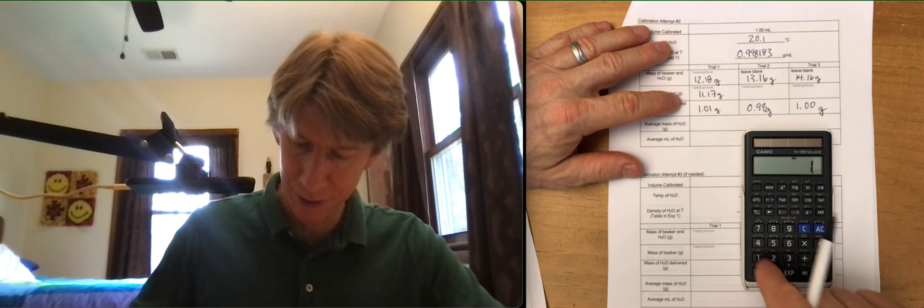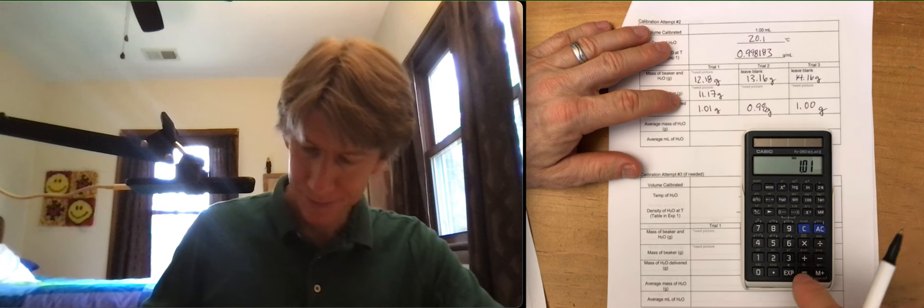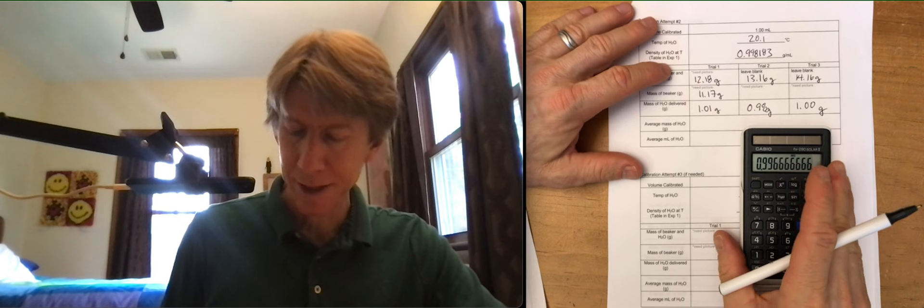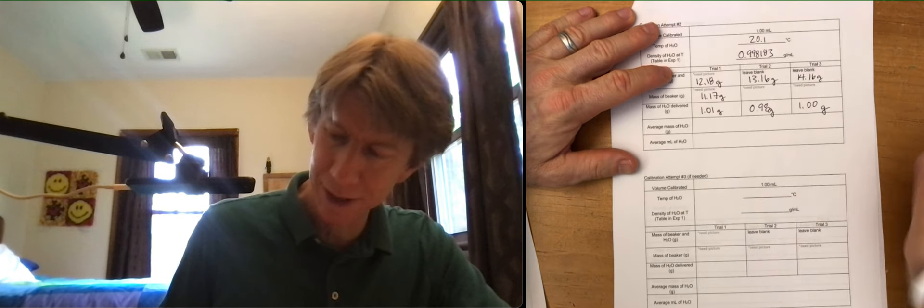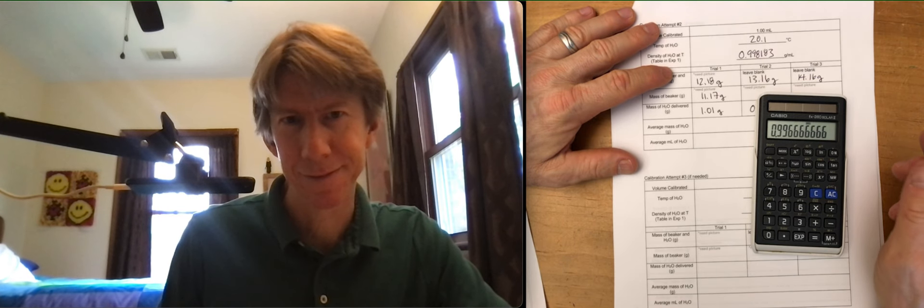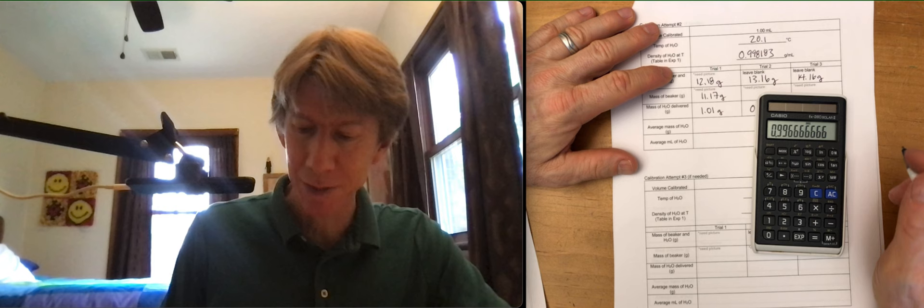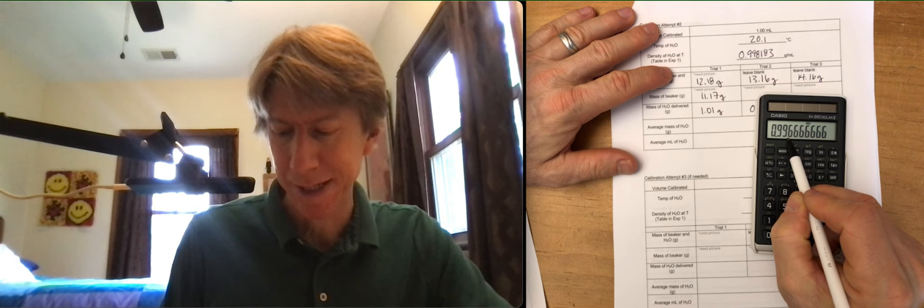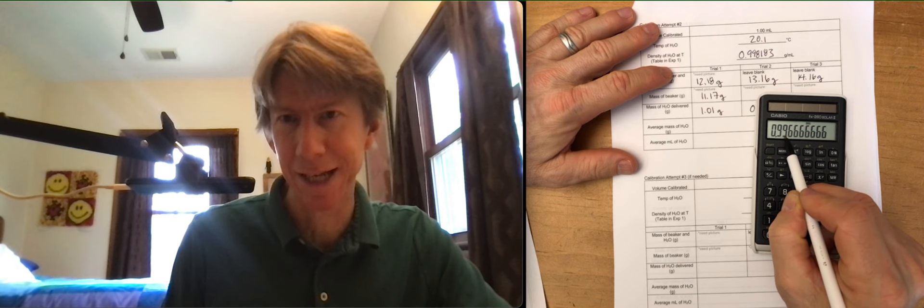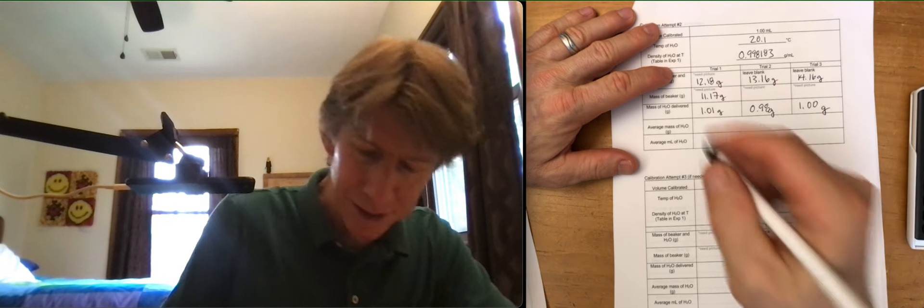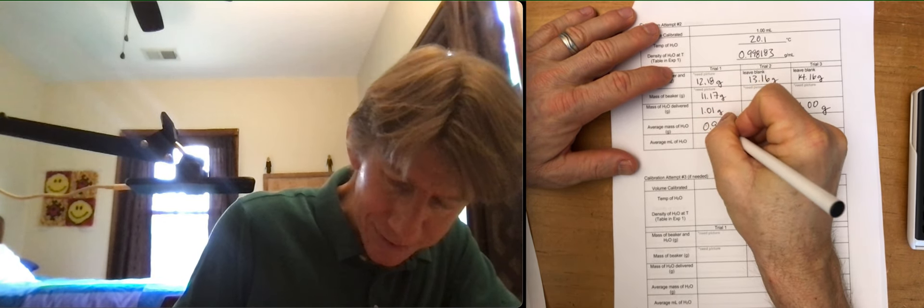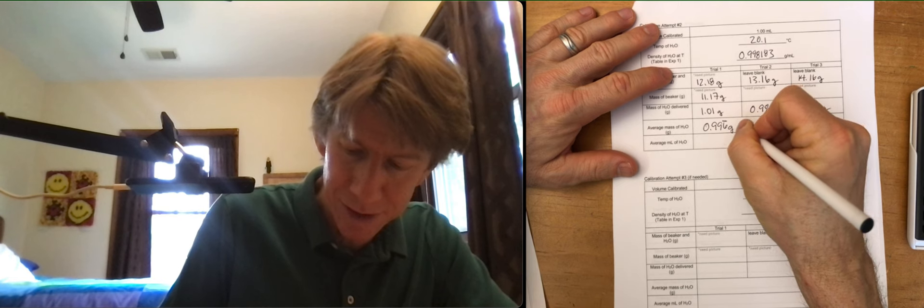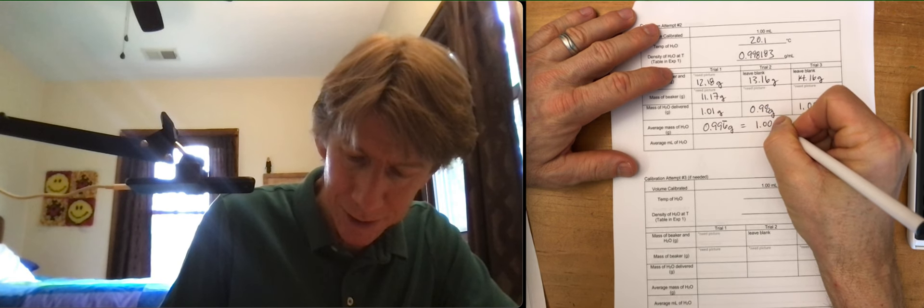The average mass is going to average these three, and I have good news for me. Plus, 2.99 divided by 3, 0.996, or rounded. This is a tricky one. I'm sort of glad we did this. 0.996, so this is a case where it should round to this second decimal place, but it kicks it over to 1.